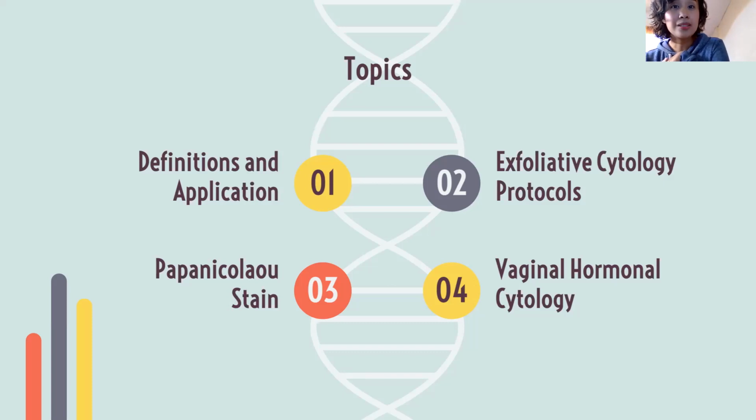Hindi natin matatanggi na usually the cells that are tested in the laboratory are pap smears, from a pap smear test. So, napaka-affordable kasi nito, napaka-accessible, and it's very reliable. So, pag-aralan natin siya ngayon.